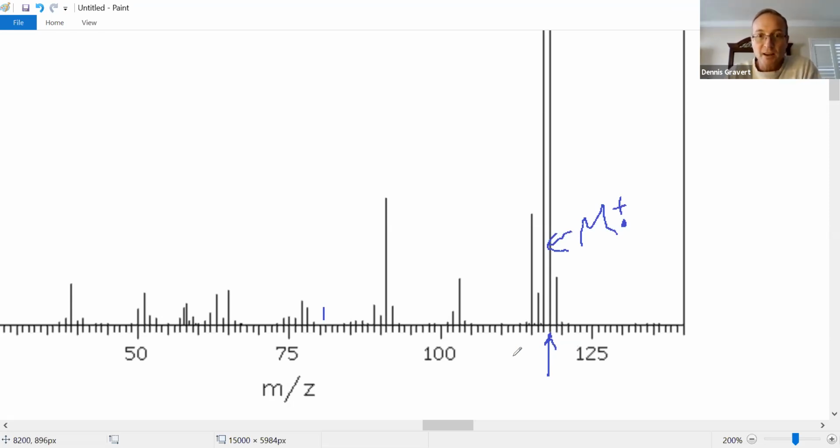Okay, so where are we? Let's go over here where it's not marked up. I got 75, and that looks like 80, 85, 90, 95, 100. Good. This is 105, this is 110, this is 115. Then this one right here is 120. And so if this is 115, this is 116, 117, 118. And yes, you do have to zoom in and be real careful, right? If you get the wrong number, you may get the wrong chemical formula. Cool, mass is 118. Step one's done, we found the parent peak.